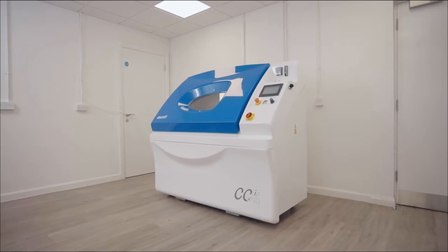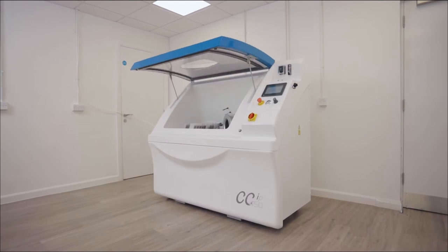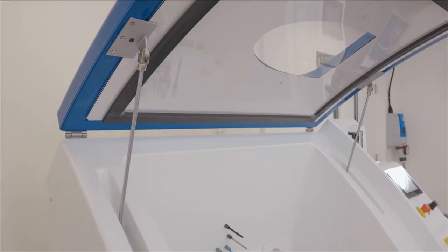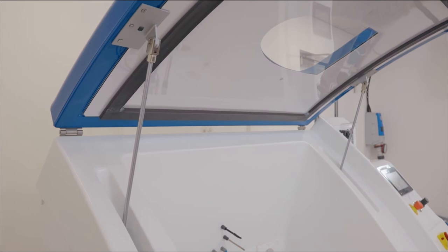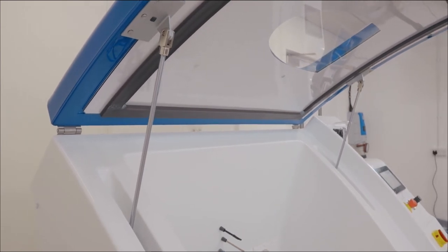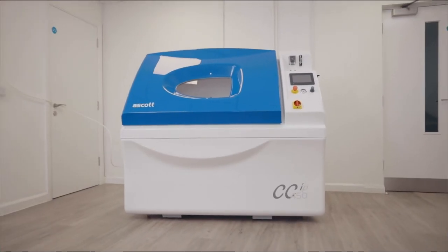We have a pneumatically operated canopy. The canopy is physically held open pneumatically. We cannot close it manually. Similarly when the canopy is closed we cannot open it manually. It is held closed.